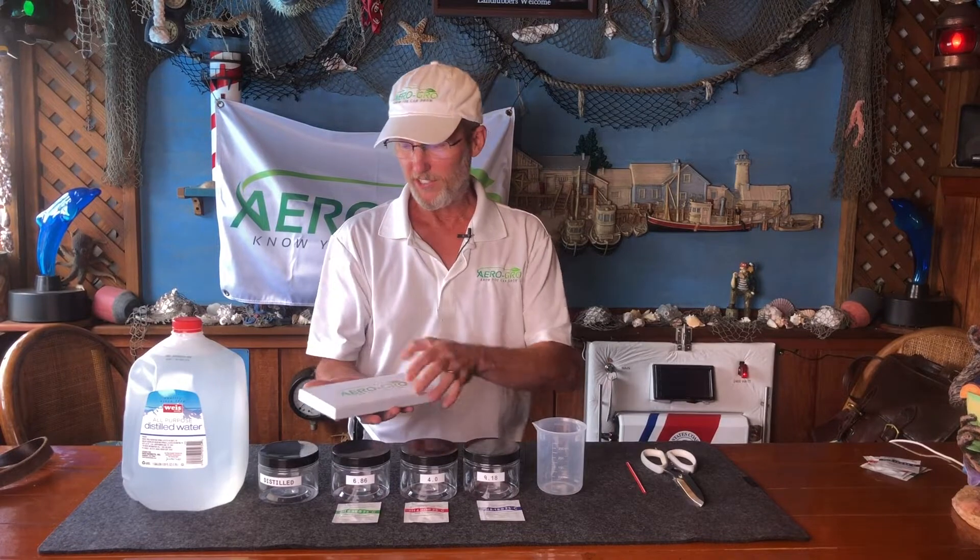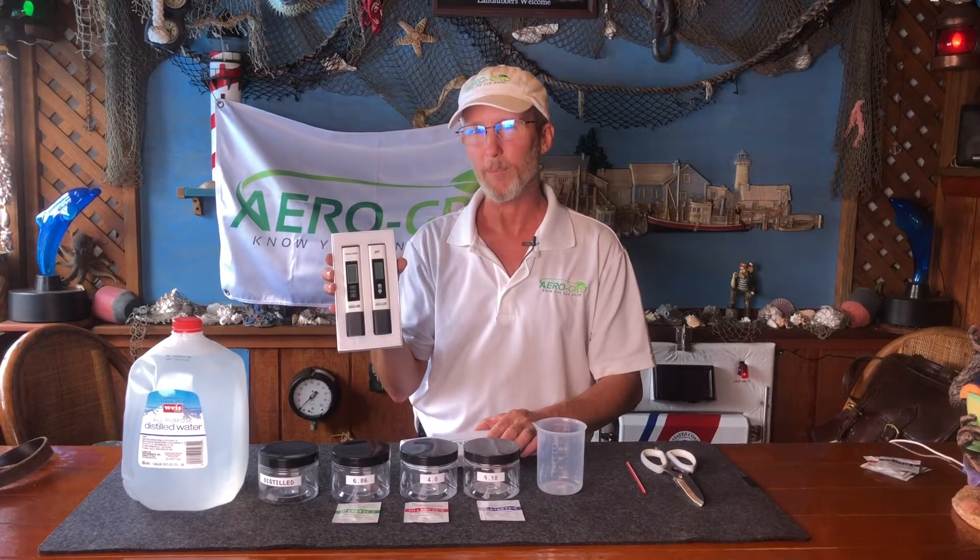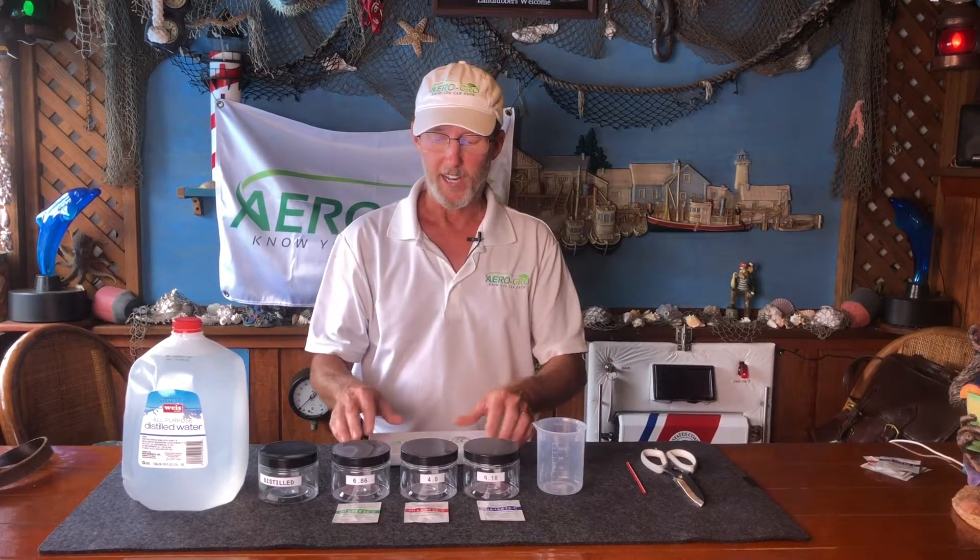Hi, my name is Andrew and I'm the owner of AeroGrow. If this meter looks at all familiar to you and you purchased it on Amazon and you're wondering how to calibrate your meter, you are definitely in the right place — that's what we're going to be doing today. The written instructions can make it seem a bit complicated, but it's really not. There are only a couple of steps and I have everything laid out right here.